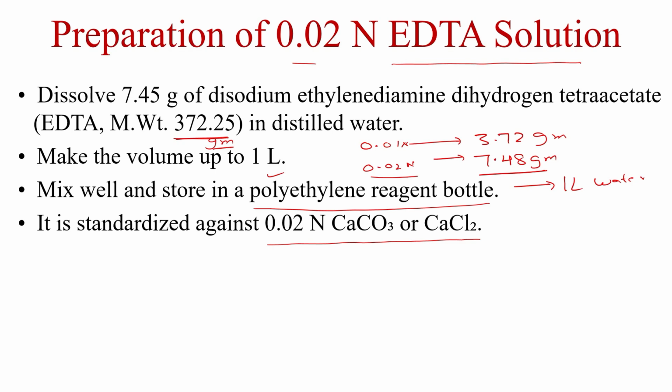Here your sodium ion, calcium ion, magnesium ion, aluminum ions all are there in the glass, so these can leach if you store EDTA solution for a long time. So if you're storing it in a polyethylene reagent bottle, EDTA will remain stable for a long period of time. That is why we are storing them in polyethylene reagent bottles.